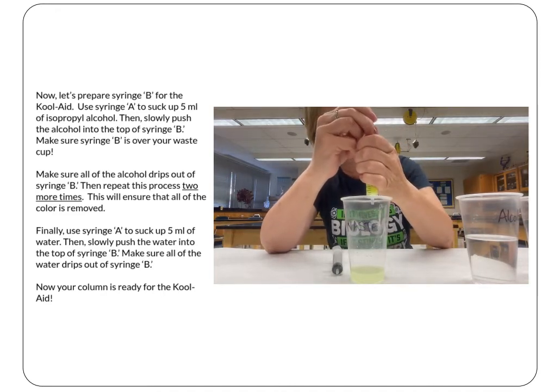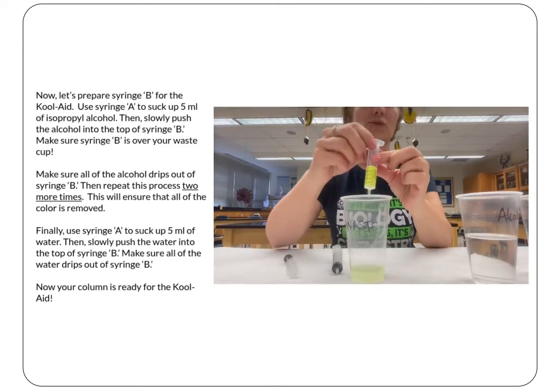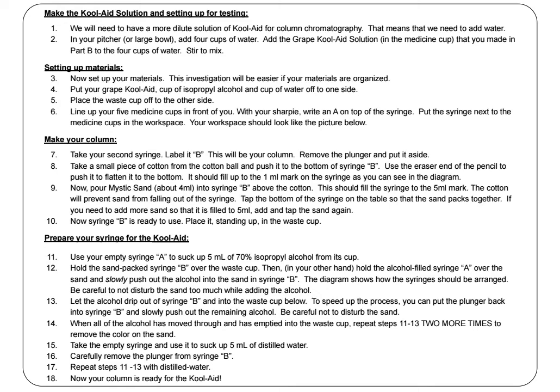All right, so I'm going to very carefully pull this out. And now our column is ready for the Kool-Aid. Pause the video now to follow our procedure for getting your materials and column set up for testing the Kool-Aid. Feel free to go back and watch the video instructions again if you need to. This is a tricky one.